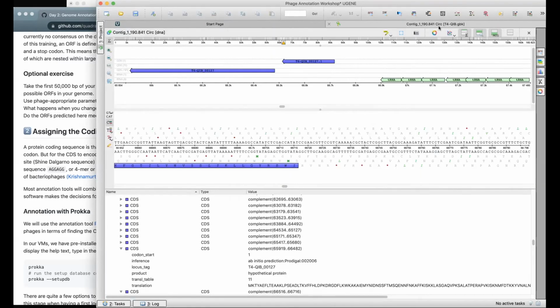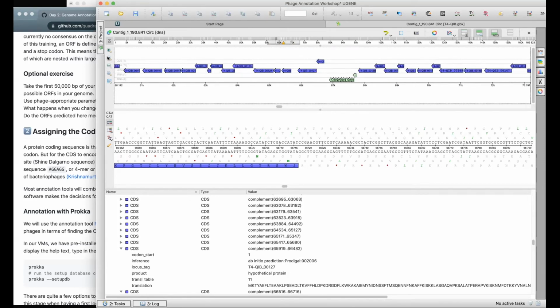Okay, where have we got? So basically what you need to do, what we're not now going to do, is scroll through your whole genome. But I've had a preliminary look, and it's actually very good compared to the actual T4. So there's very few regions where there are any problems or where we have to look to extend it. But I hope that Andrew's lecture and my scrolling through here gave you an idea of what you need to look out for.